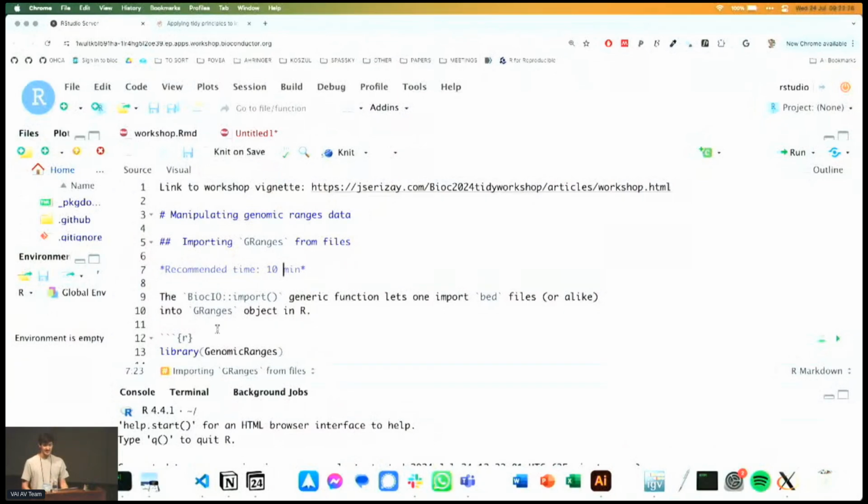So I don't have any slides. It's literally just going to be coding today. Before we get started, can anybody who has any idea of what tidy data analysis means raise their hands? Yeah, a little bit. Okay, so for those of you who didn't raise your hand, tidy data analysis means essentially using a certain number of operative verbs to wrangle tabular data.